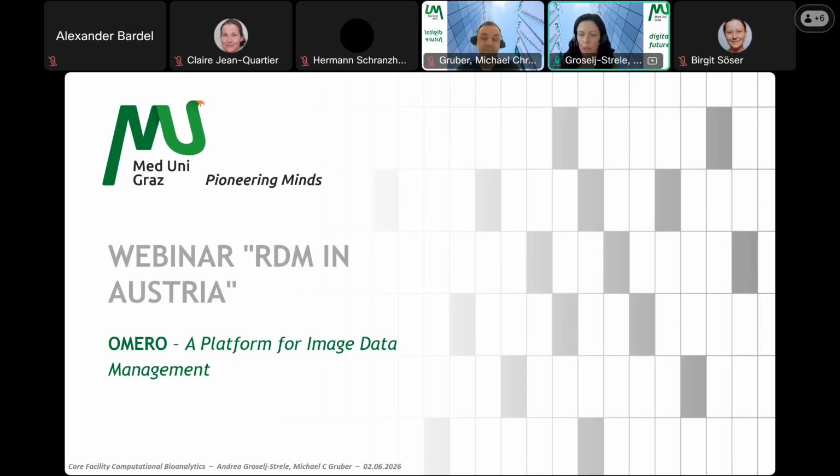And today we'll talk together with my colleague Michael Gruber about OMERO. And he will also give you a live demo. I think this is the most interesting thing of today.